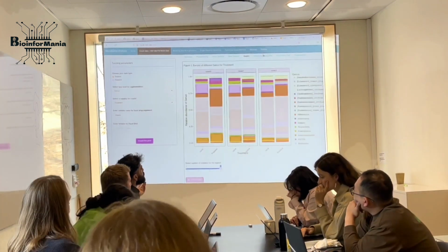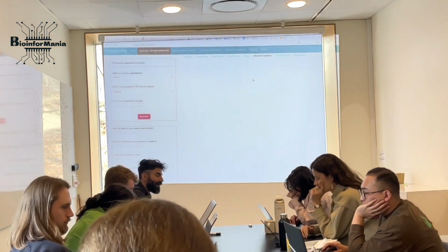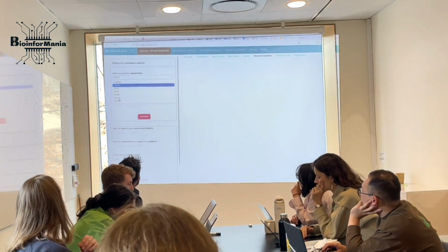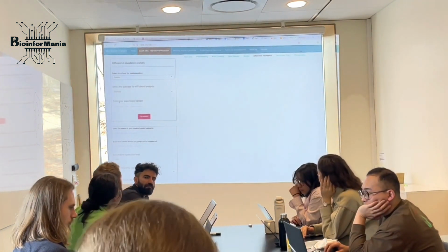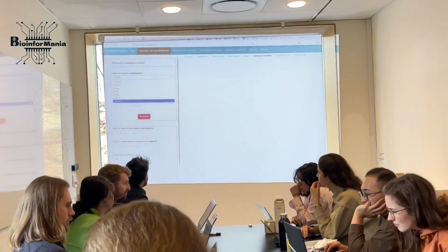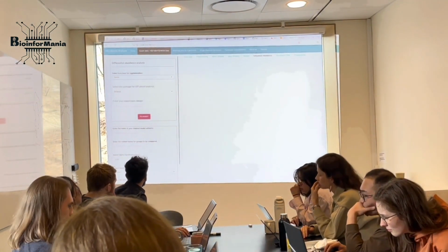I'm going to differential abundance analysis. Do I still see these changes in Prevotella? So what I do here, I select the taxa level for agglomeration. Let's do species. Let's do genus, because I'm interested. This plot was in genus, to see if it can capture anything. Okay, let's go to genus.